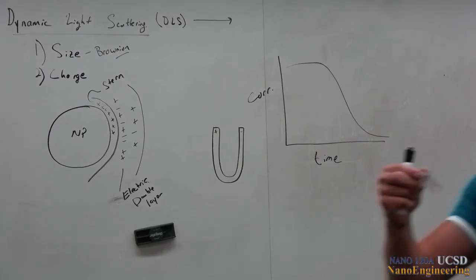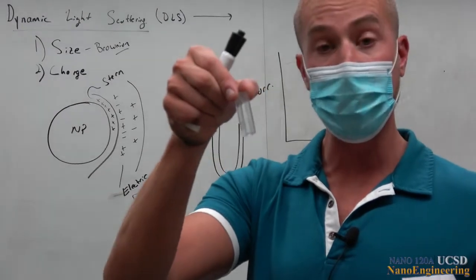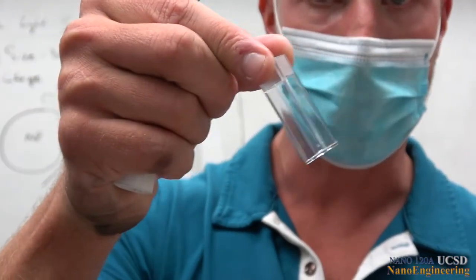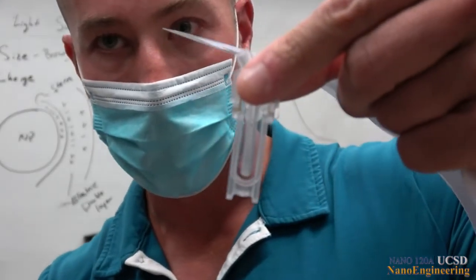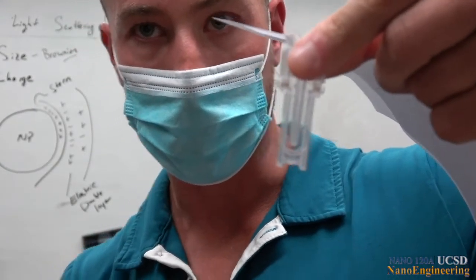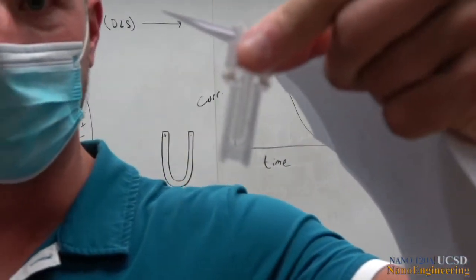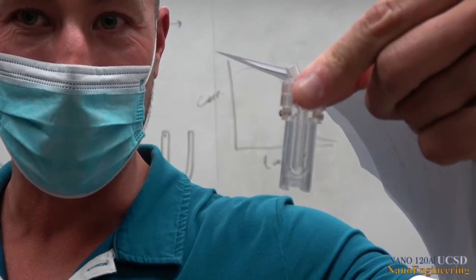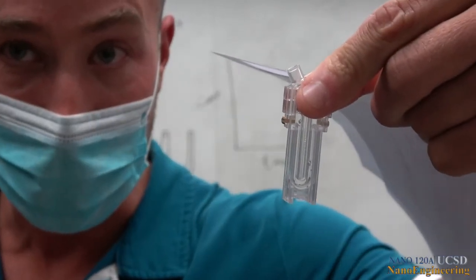So the cuvette for the sizing looks like this. And so, just a standard cuvette. And here is the cuvette for zeta potential. And so it's focusing on my face. So there you can see it's kind of like this. There it is, it didn't focus.